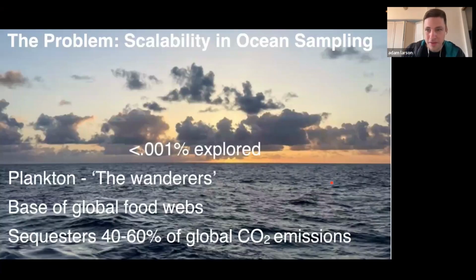So I think, again, with this problem, which we've opened up to a huge community, we've actually been able to approach these large problems. Anybody studying the ocean knows the ocean is very big. So studying the ocean is a huge problem, especially when you're looking at microscopic things. What we're interested in is plankton. These are any microscopic organisms that are at the mercy of the ocean's currents to float around. And while they're small, they're extremely important, right?